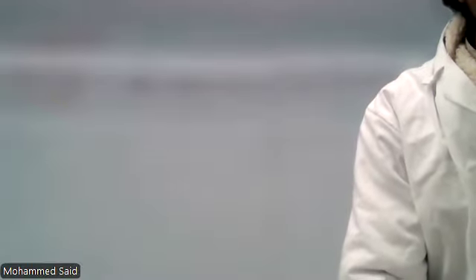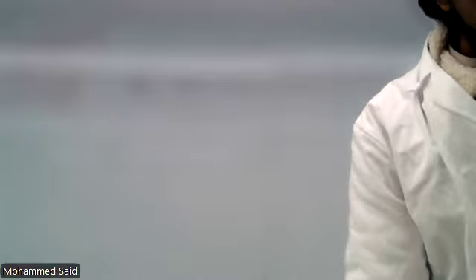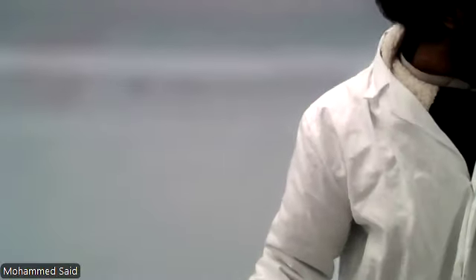If you haven't done your 45 minutes, it's okay if you had it suspended already in the dye and you're waiting now until 90 minutes. You could do both of them, but I recommend that if your group has the grid that you use for the microscope, please return it back immediately once you're done. Like in the next 2 minutes, there should be an opportunity for group number 1 to grab one. Thanks a lot.